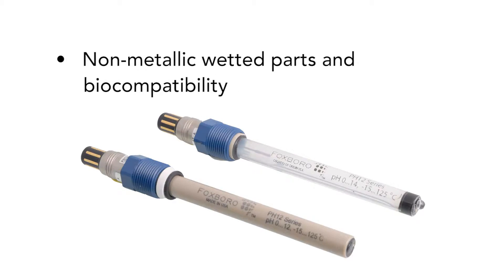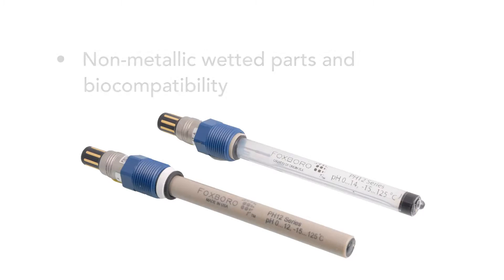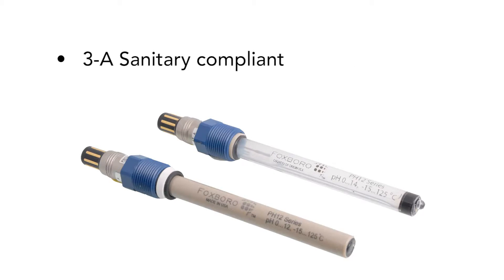Non-metallic wetted parts and biocompatibility — sensors are immune to attack from most processed fluids, thus greatly extending the service life. 3A sanitary compliant for industries such as pharmaceutical and food and beverage.